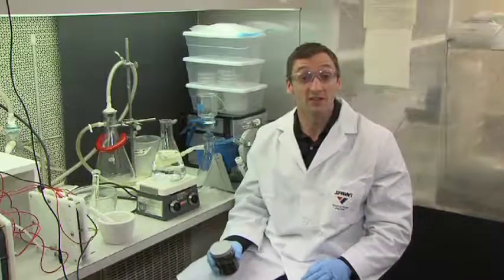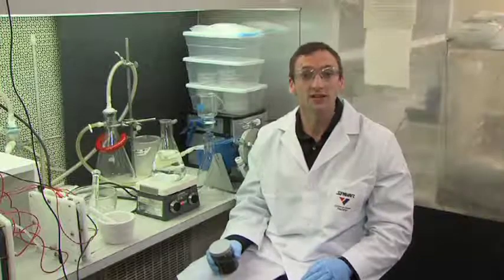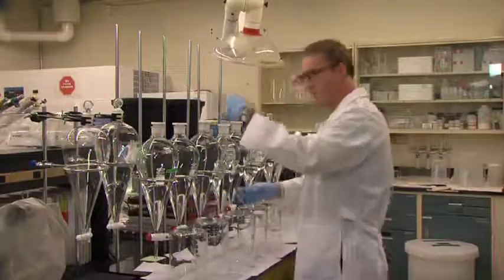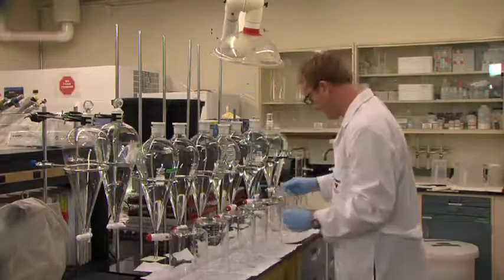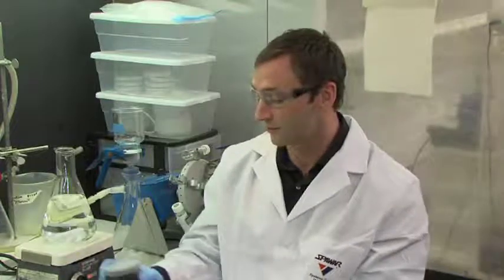The 5 basic steps of the TCLP are: Step 1, separation. For wastes that are liquid, meaning they contain less than 0.5% dry solid material, the waste is filtered through a 0.6 to 0.8 micron glass fiber filter. That filtered liquid is considered the TCLP extract and is used for analysis. For waste containing greater than or equal to 0.5% solids, the liquid, if any, is separated from the solid phase and stored for later analysis.